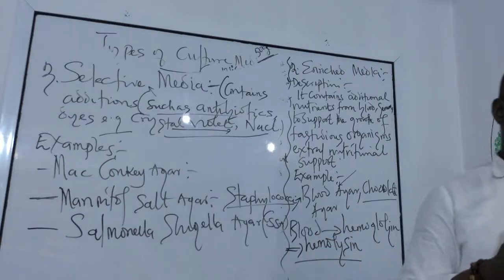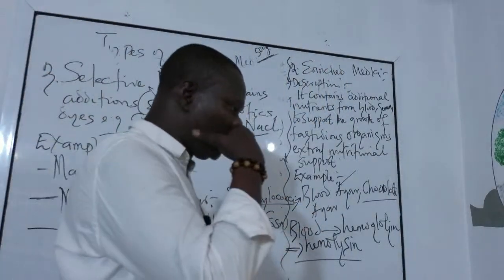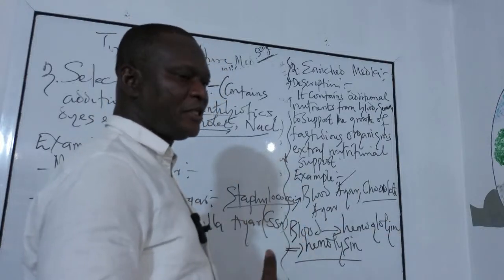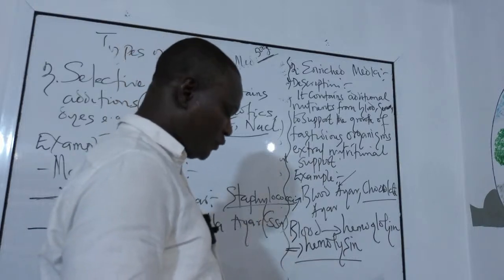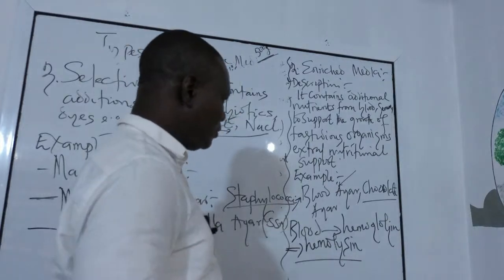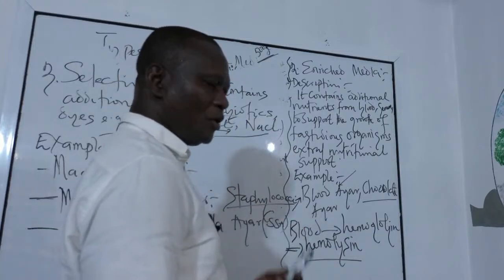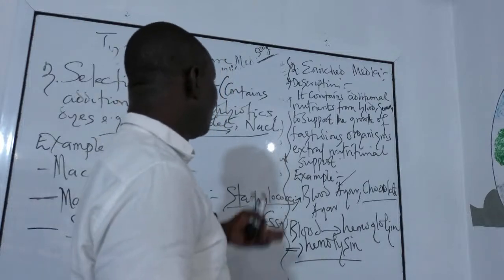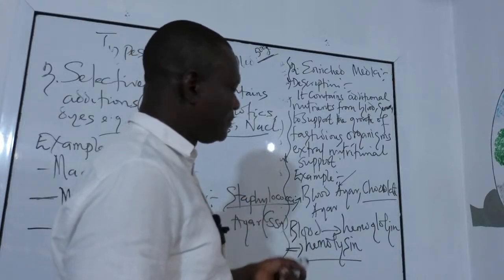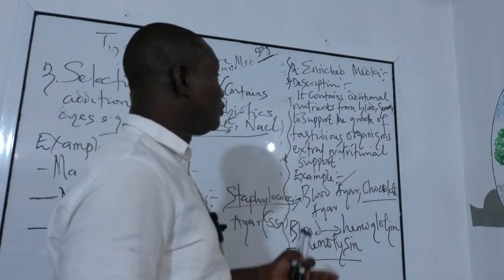But in the pre-recorded video that I told you about, I only demonstrated and showed you some of the basic things that you will require before you cultivate microorganisms. If you are looking for any microorganism, you just want to study the way they grow, your mind should be towards general purpose agar, which is nutrient agar or nutrient broth. If you are looking for fastidious microorganisms that require extra nutritional support, you grow them in either blood agar or chocolate agar, which are enriched.